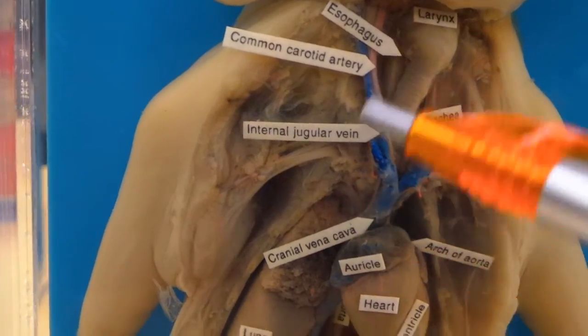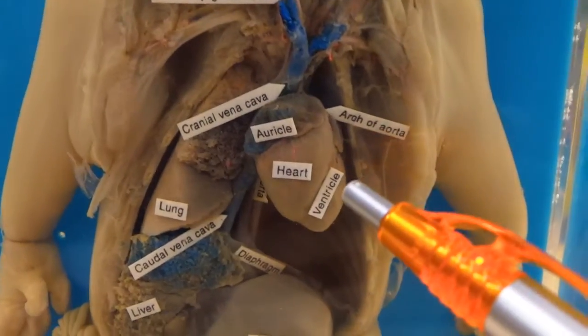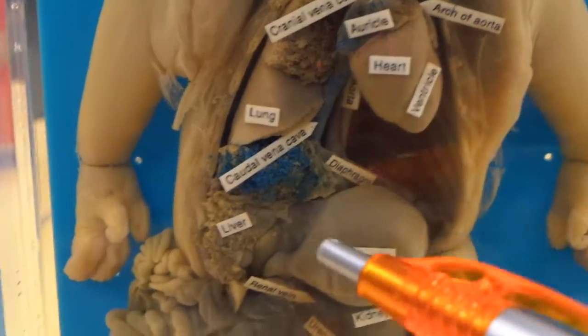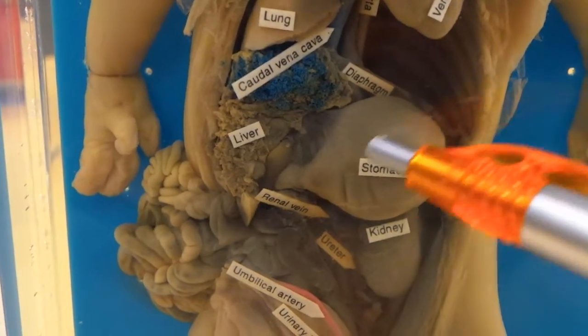You can see the arteries are labeled — they typically don't test you on that though, but that's fine. Of course, that's the heart. These are the lungs. This is the liver over here. And this is the stomach.